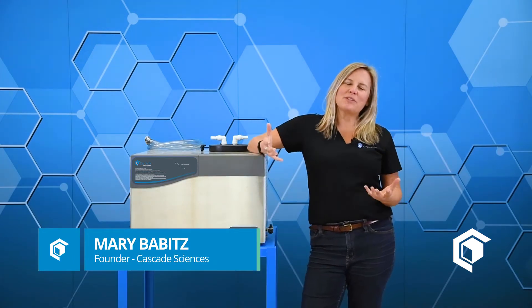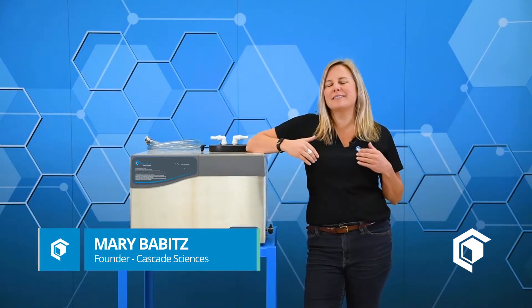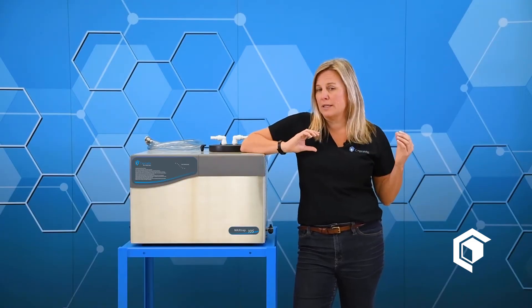Hi everybody, I'm Mary with Cascade Sciences. The purpose of this video is to provide a quick start guide for the Cascade Sciences cold traps. We have a couple popular configurations that I want to give you a quick rundown on as to how to get up and running as quickly as possible.